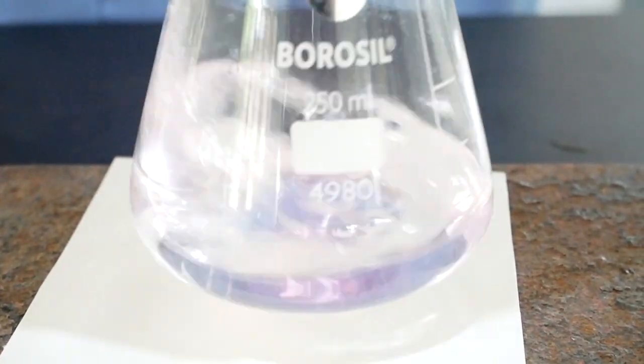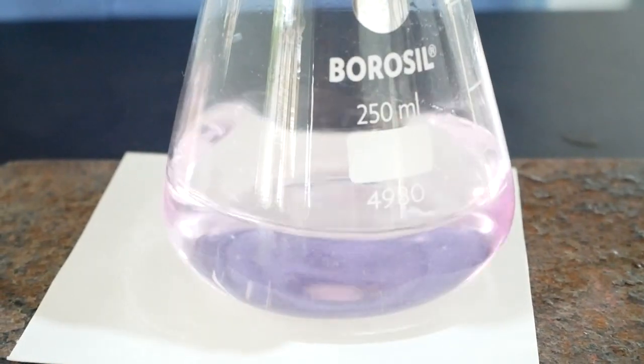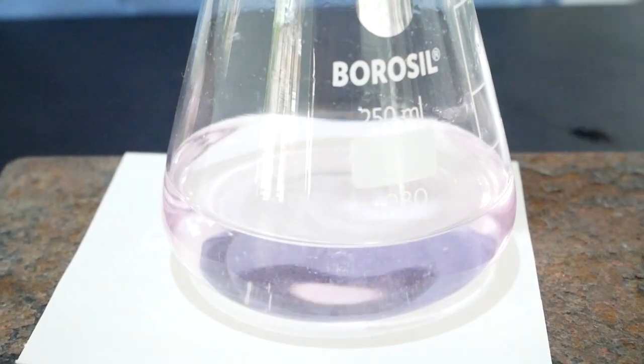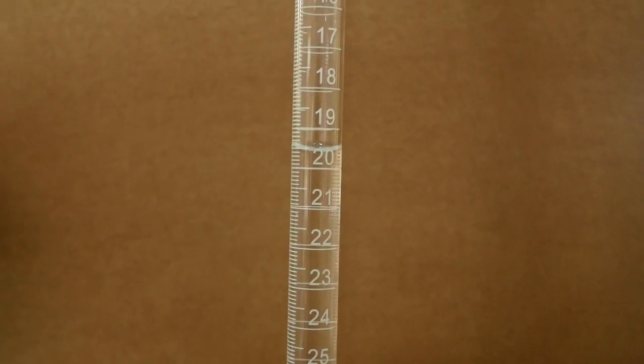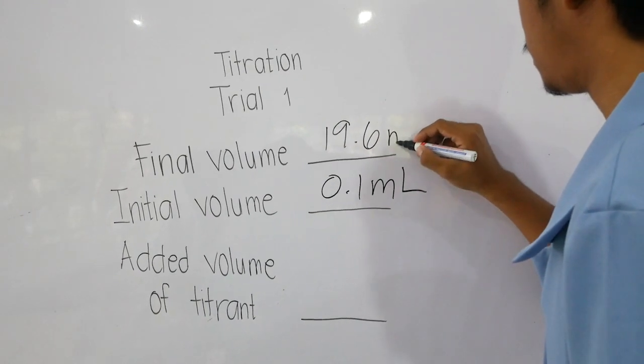The white paper below the flask makes it easy to see the pink coloration. Take note that we only want a very faint pink color to appear. When that happens, record the last burette reading as the final volume.